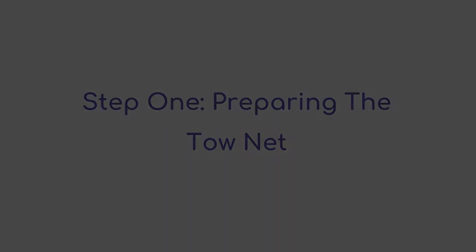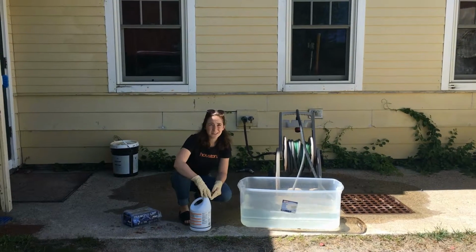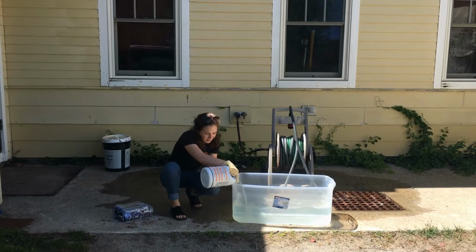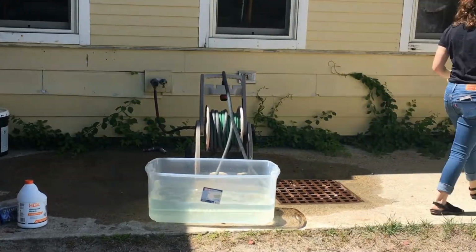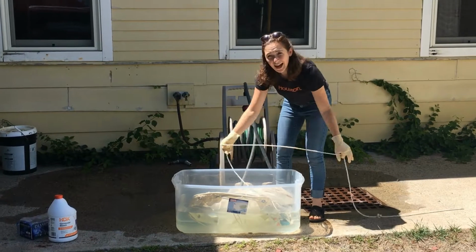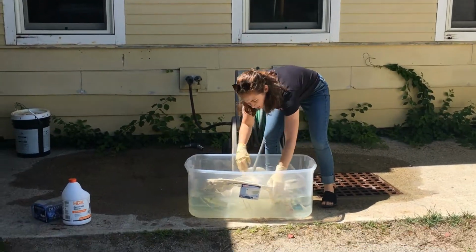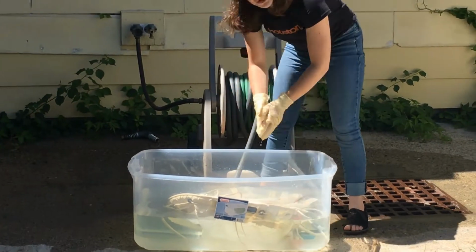First thing that you're going to do is get a big plastic bin, fill it up with 10% bleach solution. You usually estimate. Then I'm going to put the larval tow net into that solution, submerge it completely. Make sure you get the cod end in there and the tow rope, anything else you want to be sterilized. Wait for 15 minutes, come back, and you're going to start to rinse everything off.